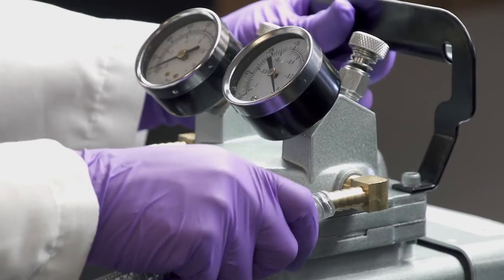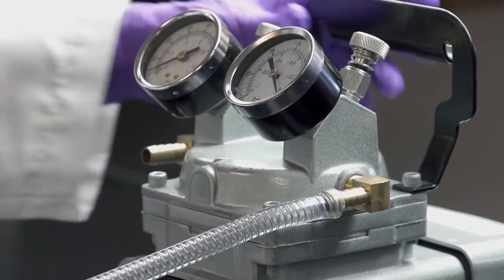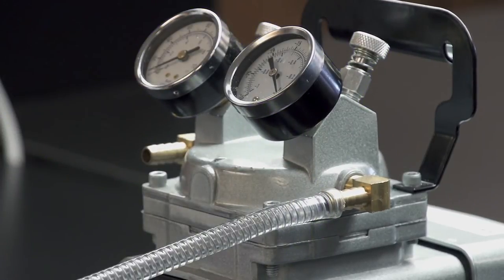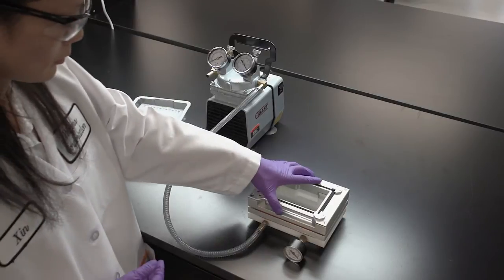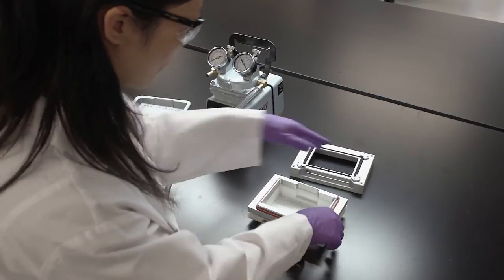connect the hose from the regulated vacuum source to the 96-well plate vacuum manifold and it is now ready to use. In this demonstration, we will be using an external vacuum pump, but you can also use a house vacuum.